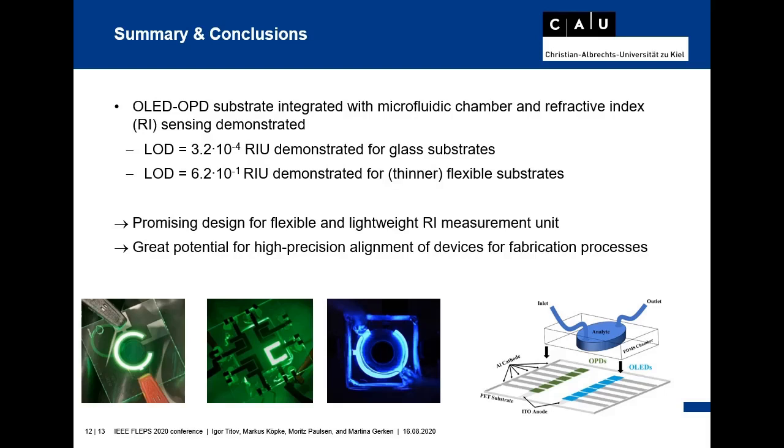This system holds great promise for a highly flexible and lightweight refractive index measurement unit. The heterogeneous integration of OLEDs and OPDs on one single and preferably flexible substrate has great potential for optical sensors with high precision alignment of the devices and serves as a platform for research, medical and several other industrial applications like improving the drug development process or monitoring of important diagnostic patient information.